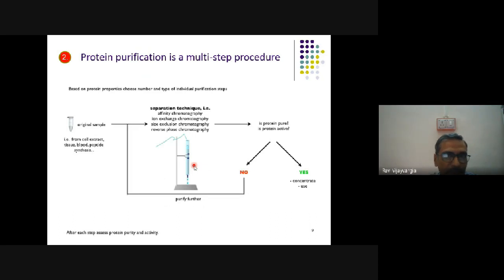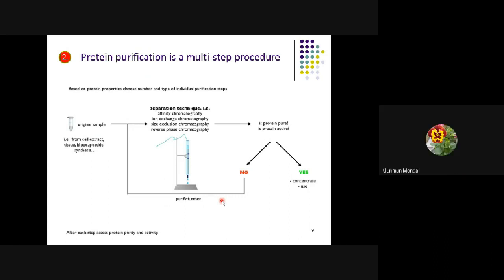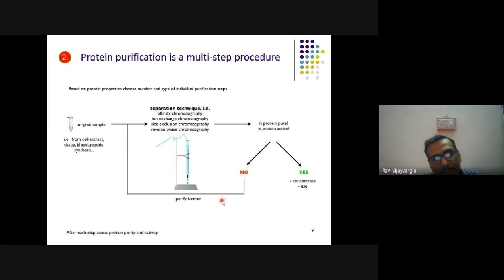Whenever you are using protein purification techniques, one of the most common techniques utilized is chromatography. Have you heard of chromatography? Yes, sir. Chromatography is the most commonly used technique for purification of protein. So whenever you are going for purification of protein, normally the first choice is a chromatography technique.